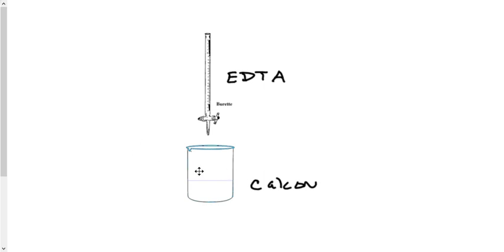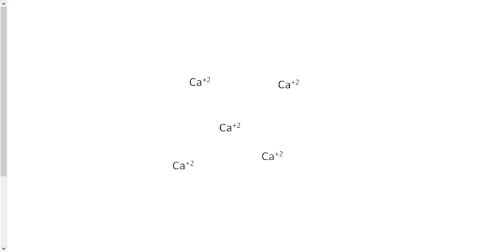We are going to look at this part right here and kind of blow it up in size. This is just our water sample here. So what does the water sample look like if we were to make it really, really large? Well, there'll be freely floating calcium ions in the water mixed all around, and we can't really see that. And how much is there? Again, not much. We're talking parts per million. Here, of course, is the surface of our water, and this is where our calcium is floating around, completely dissolved in the water. But our water looks totally clear because we can't see those.